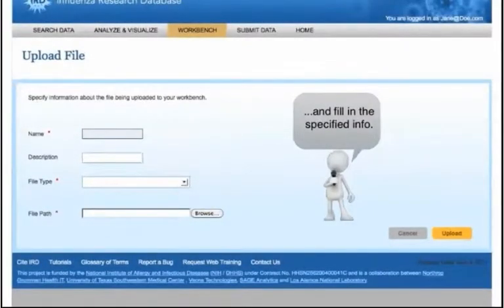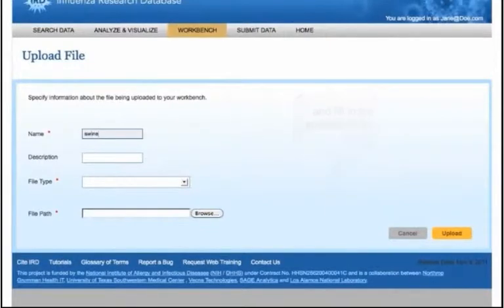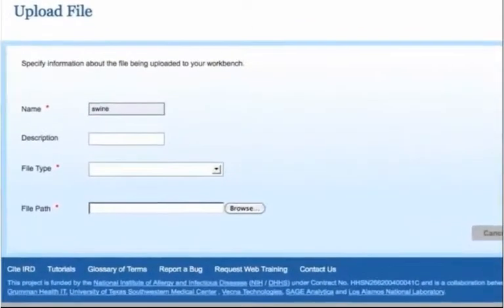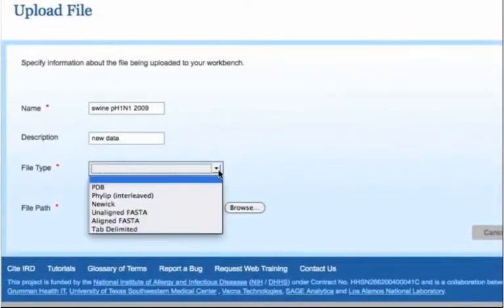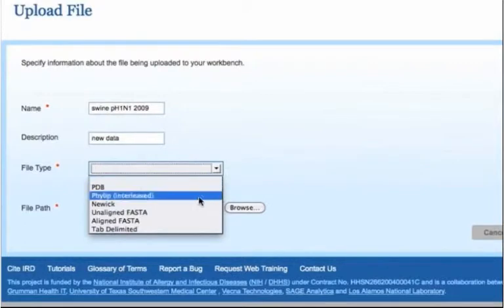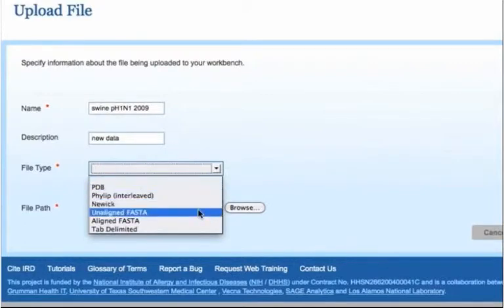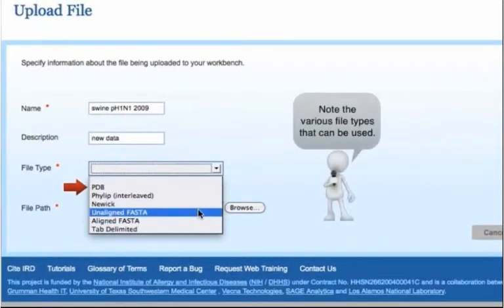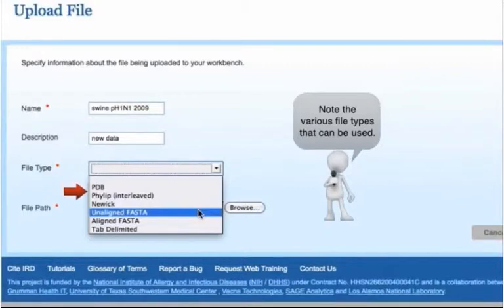For example, you can upload your own FASTA formatted sequence file to your workbench and analyze your sequence using IRD tools such as BLAST, sequence alignment, phylogenetic tree, SNP analysis, etc. Choose a file type.